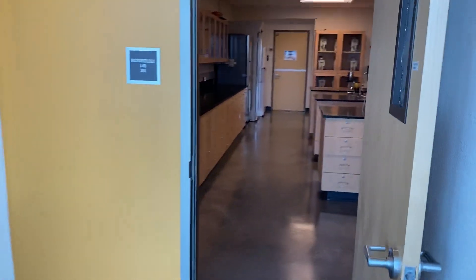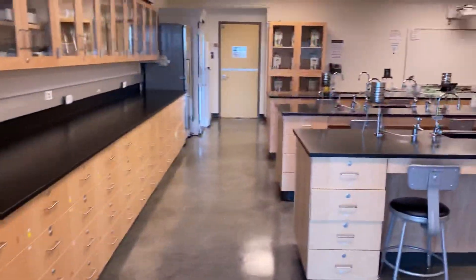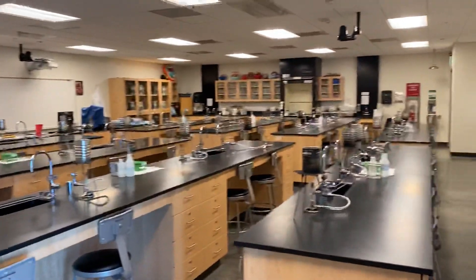Let's get a quick breakdown of the lab room as you go in. Remember, you're going to lab 204. This is more or less our breakdown.